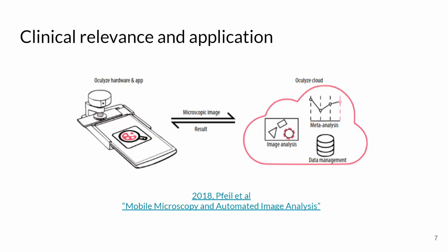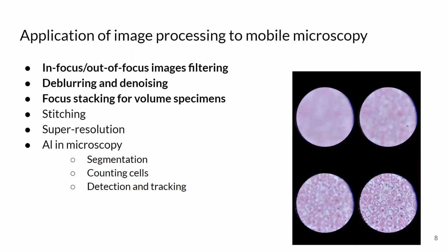Also, there is a set of works with the concept of mobile microscope usage as a fast, cheap, location- and, most important, knowledge-independent system, where a smartphone is used as a capturing device that sends data into the cloud, where all calculations are done, and results and recommendations are sent back to the smartphone. In the last decade, a significant step was made in the creation of mobile microscopy devices.